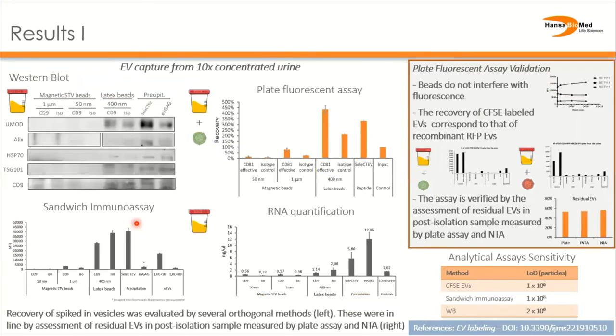Coming to the results, we can see that western blot allows us to detect EV markers in the latex bead samples and peptide precipitation samples. However, at the same time there is high uromodulin contamination in these samples visible. Samples from magnetic bead isolations fell below the detection limit of this western blot.